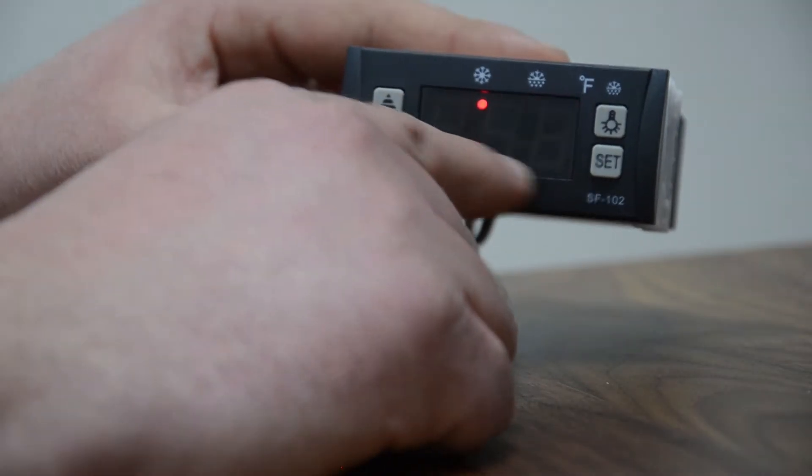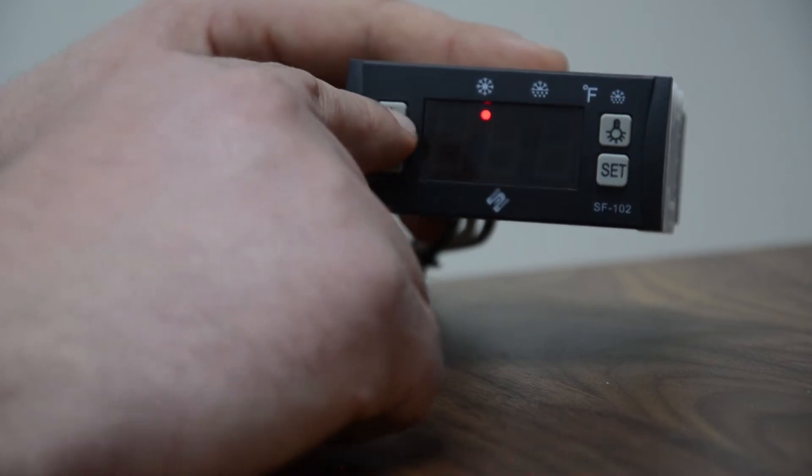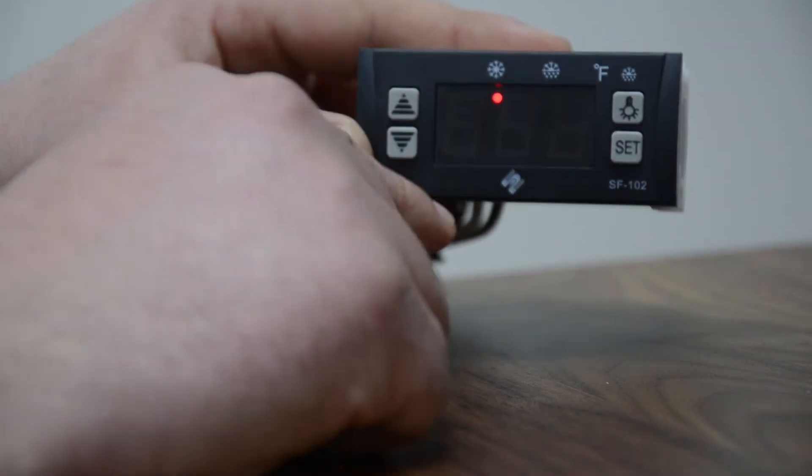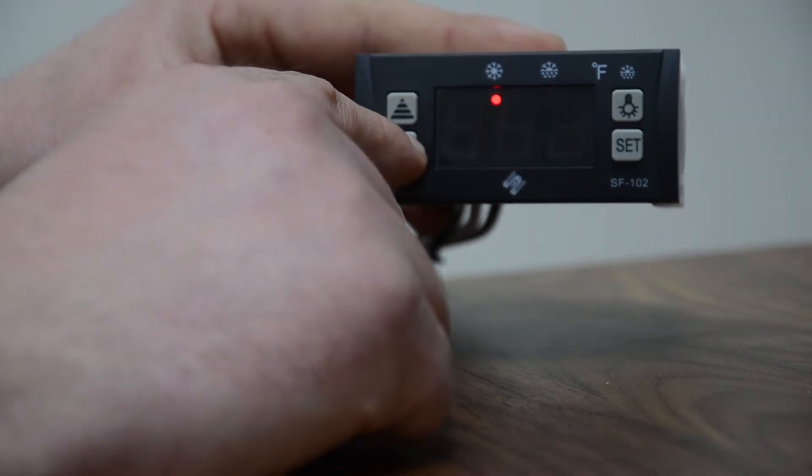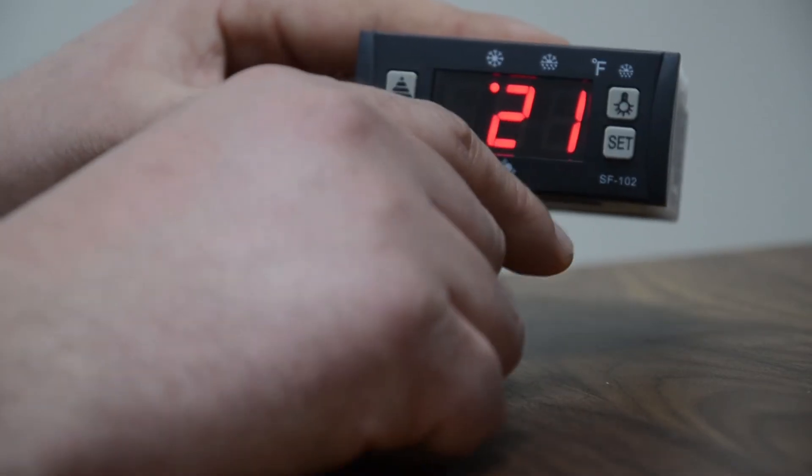Press the set button and it shows zero, so that's our desired temperature. To increase it, press the up arrow. To decrease it, press the down arrow. We want it for zero, and then you would press set, and away we go.